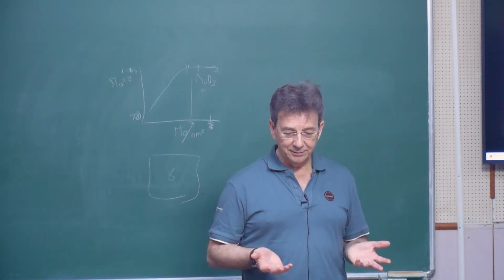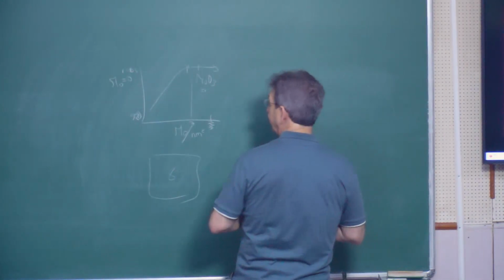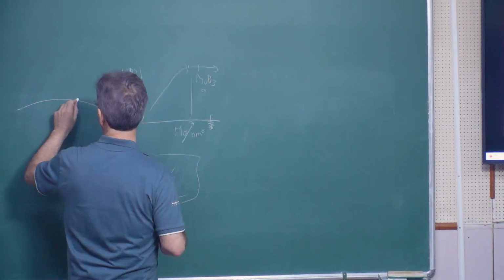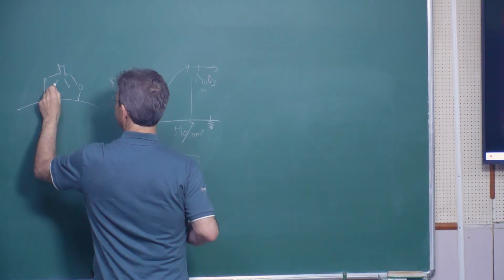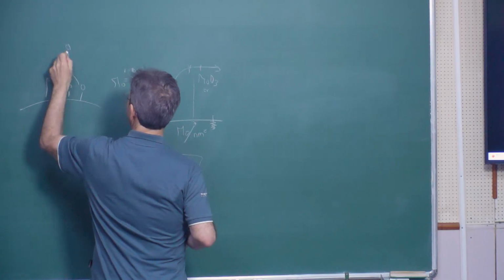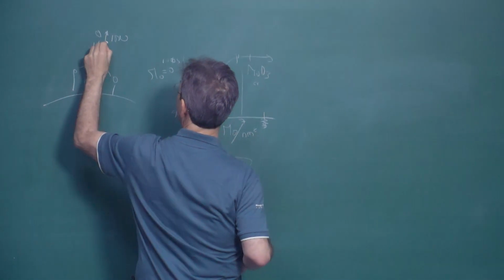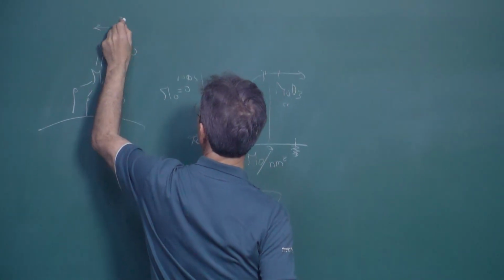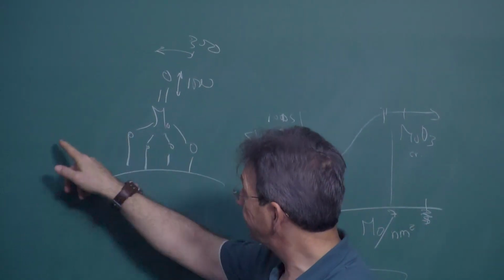Ambient, hydrated. This kind of model I was drawing yesterday, it's good. You have the support, you have moly here. This is a stretching at about 1000, the bending will be like 200-300, and then you also get the moly-oxygen-support or the moly-oxygen-moly.